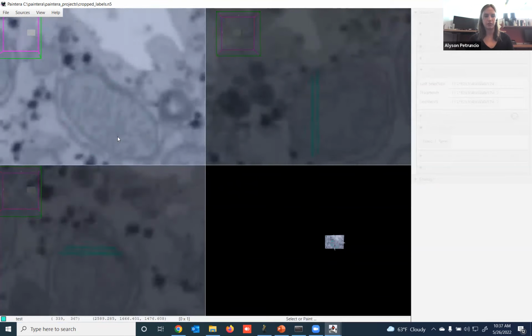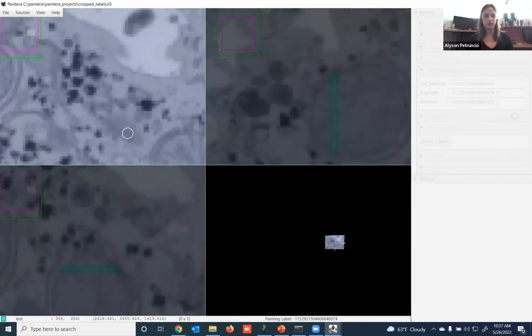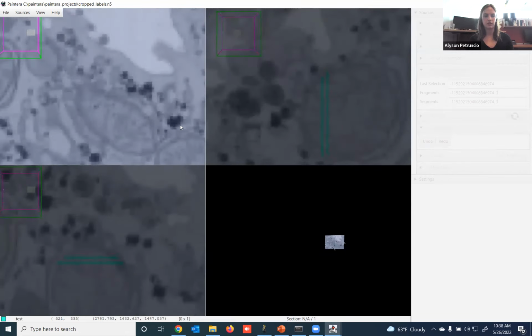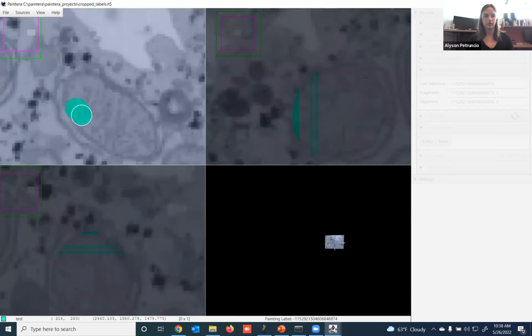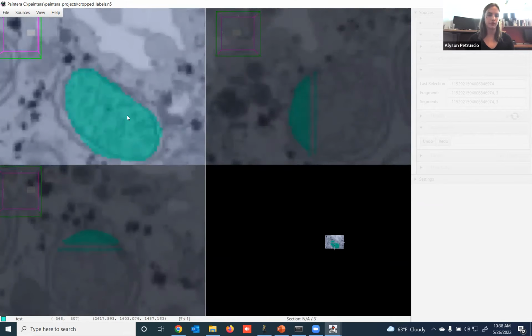If I go into interpolation mode, I can continue adding with that new fragment. And again, you see that there is a temporary ID assigned.